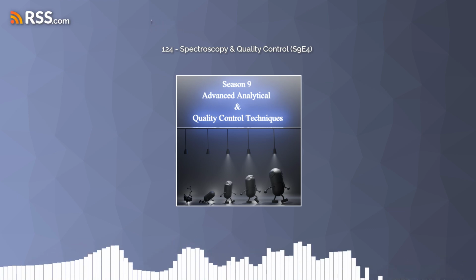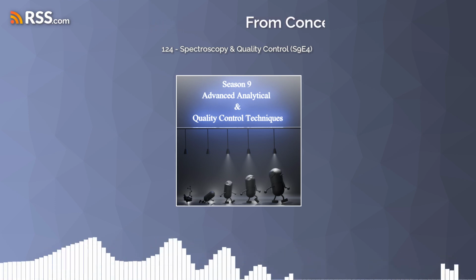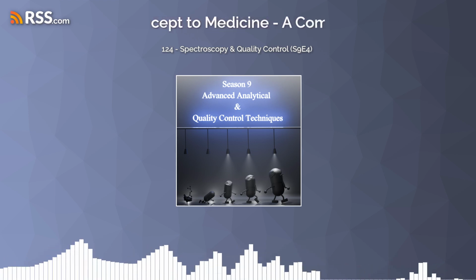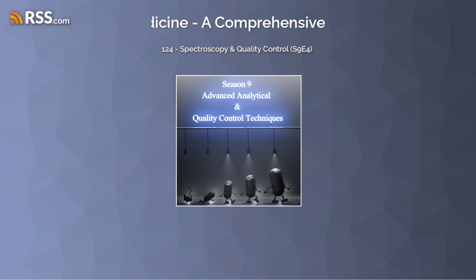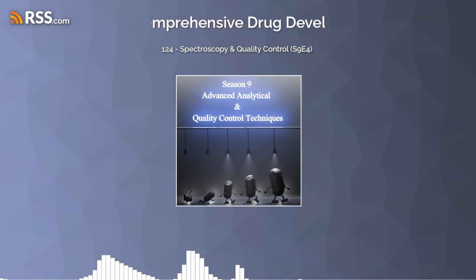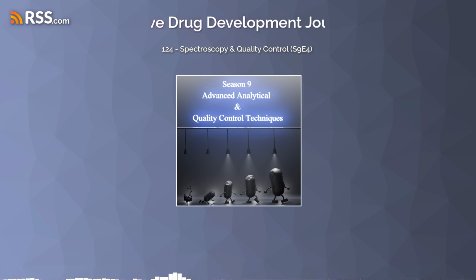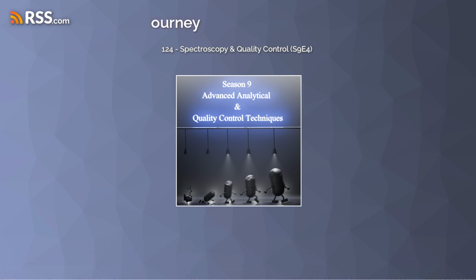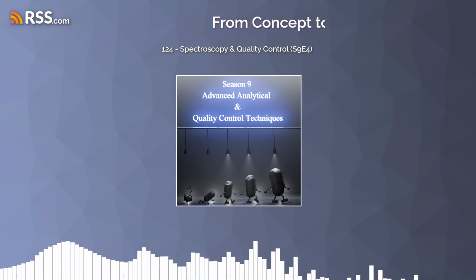You can figure out the bonds between the atoms. You can figure out the three-dimensional shape of the molecule. Wow. You get a lot of information from NMR. So that one is definitely the most detailed. Yes, absolutely. You were saying that's particularly good for organic compounds? It is. It's really the gold standard for identifying and characterizing organic compounds.